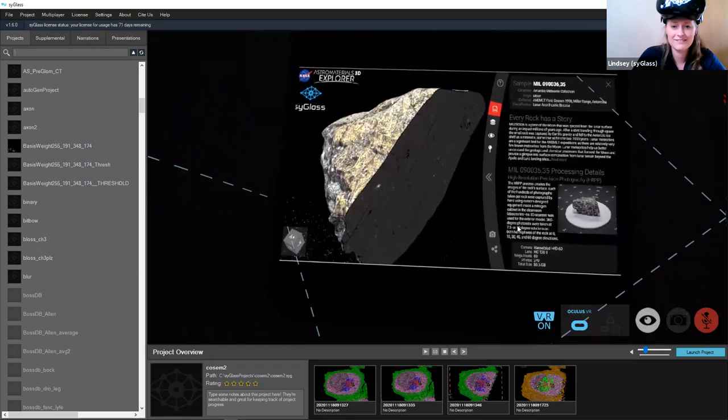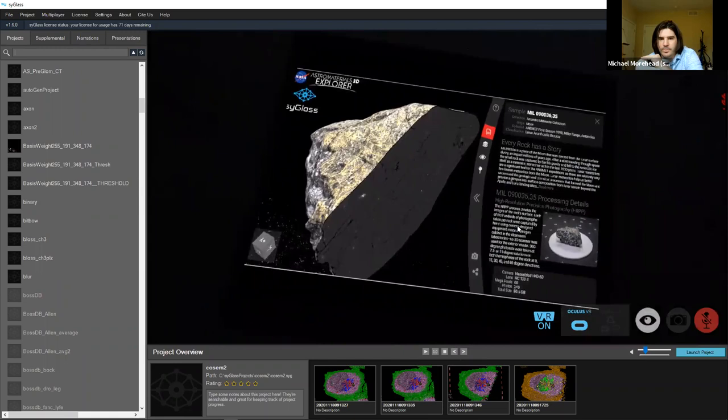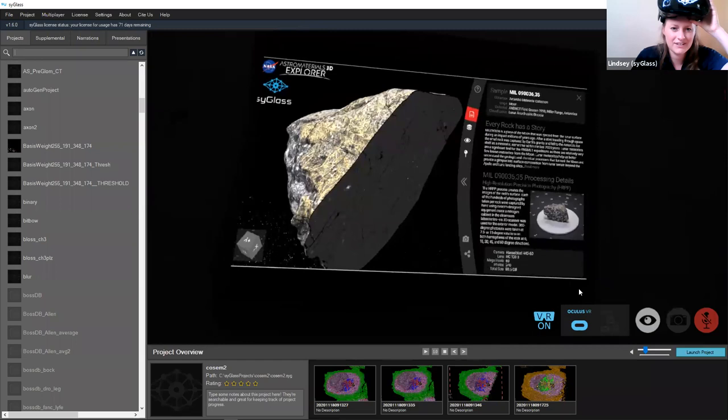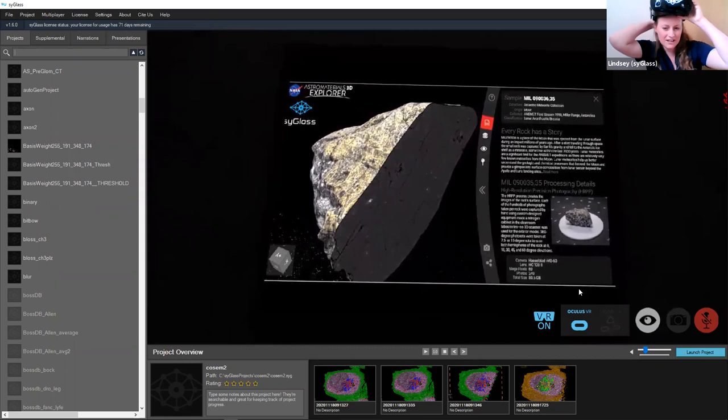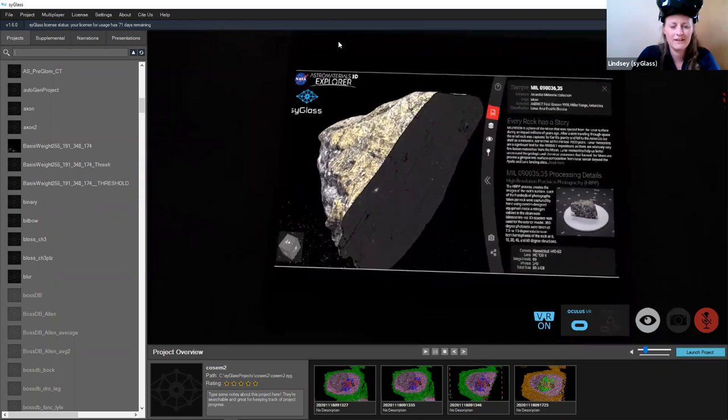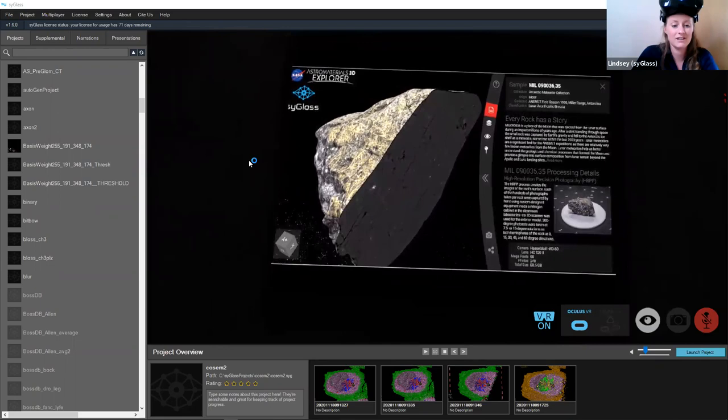Lindsay has loaded some moon rocks: NASA have done an astro-materials project in which certain astro-materials are being scanned in X-ray CT machines, and this data is freely available on their website. Lindsay downloaded the TIFF stack and loaded it into Syg lass — this is a screen grab placed on the TV inside VR.